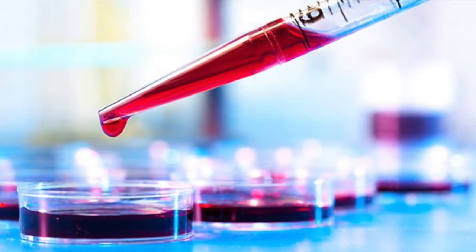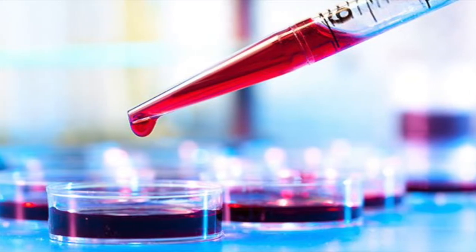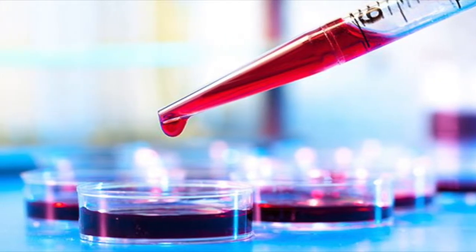Our microfluidic channel design will be used in conjunction with a laser to diffuse bacteria out of whole blood to be analyzed directly. This separation technique, combined with lab testing, could be used to quickly and accurately identify any bacteria present in the subject's blood.